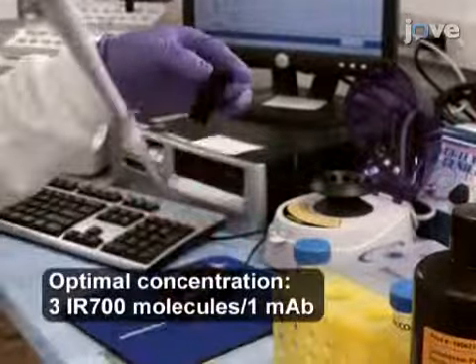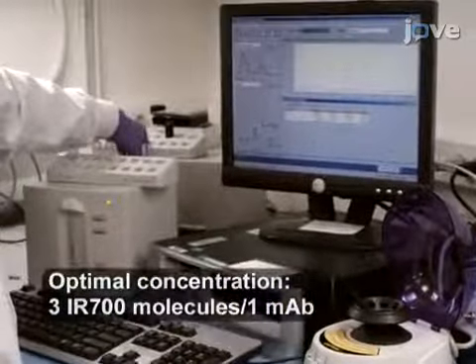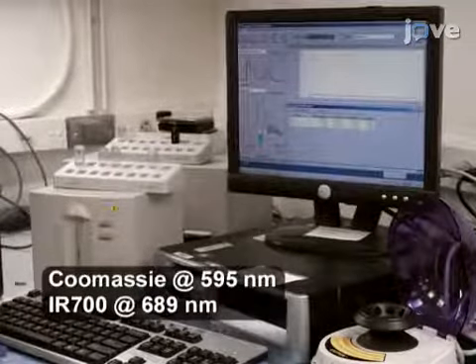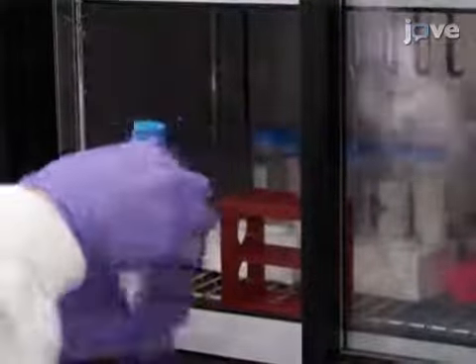To confirm the number of fluorophore molecules conjugated to each monoclonal antibody molecule, use a spectrophotometer to determine the monoclonal antibody protein concentration. Then store the conjugate at 4 degrees Celsius.